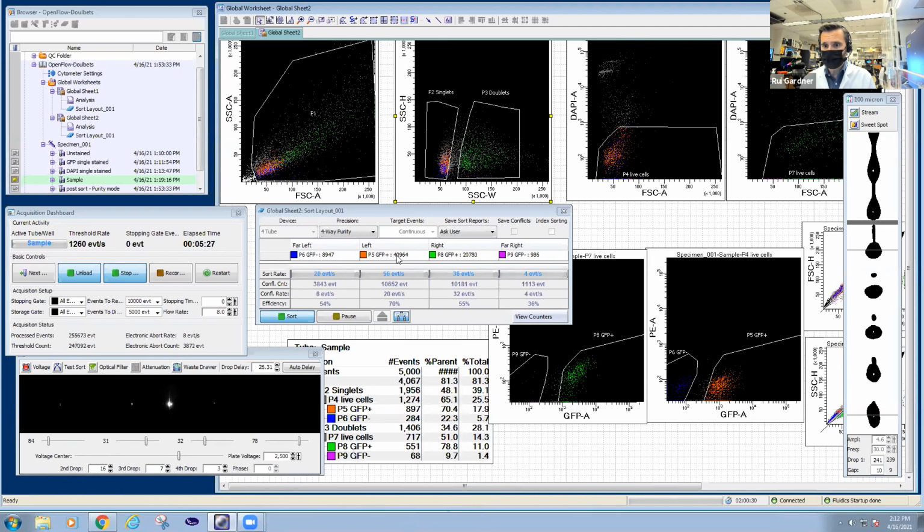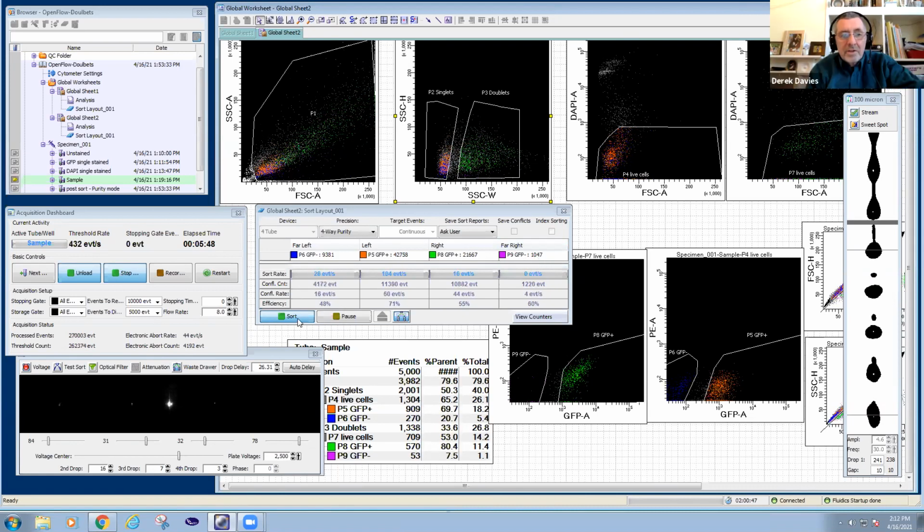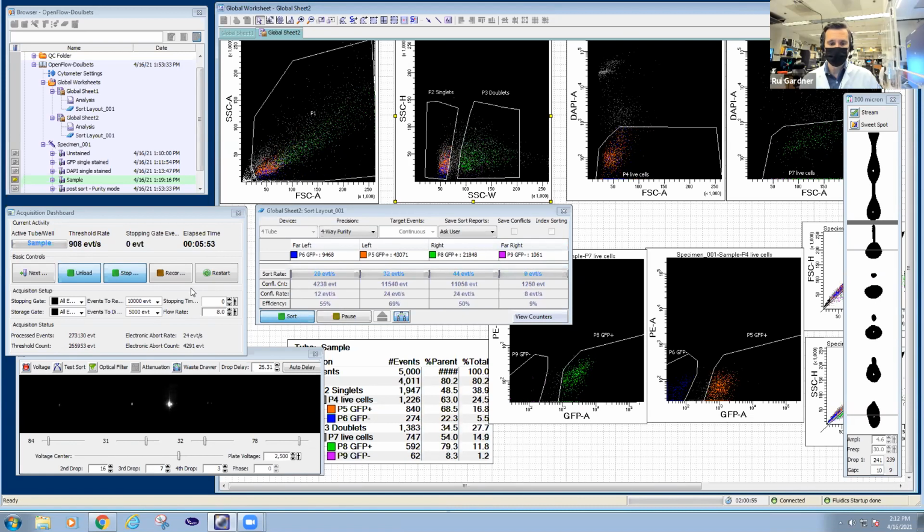Okay, I don't know if you want to show any more slides, Derek, or answer more questions. I'm just going to leave it a little bit more because we still have only 1,000 events here. Actually, no, I can stop now and let's see if we can measure something out of here. I've got a few last slides to show, and obviously you want to do a quick clean. Yeah, exactly. If anyone has questions about cleaning, I can also answer that later.